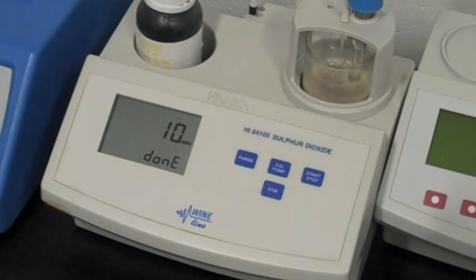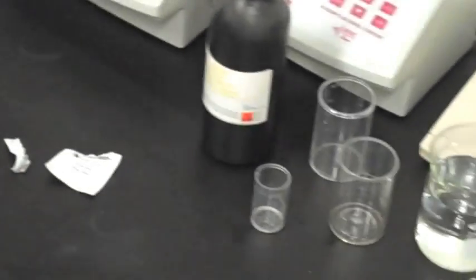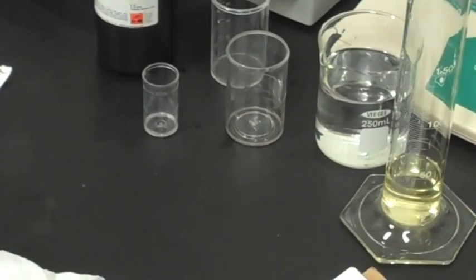And what happens is that sulfur is going to bond to all kinds of different stuff in the wine. And then it's actually going to end up reducing, and we're going to have to add a little bit more sulfur before we bottle.